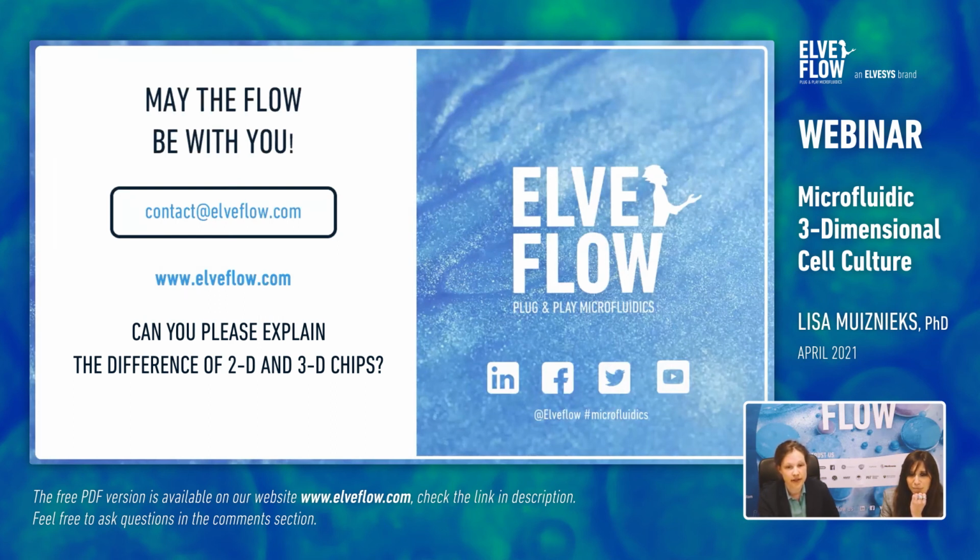The cells are loaded or seeded first, and then the chip is held static for a few hours, or 6 to 24 hours, depending on your cell type, for the cells to adhere. And then afterwards, you flow fluid through one channel, for example.